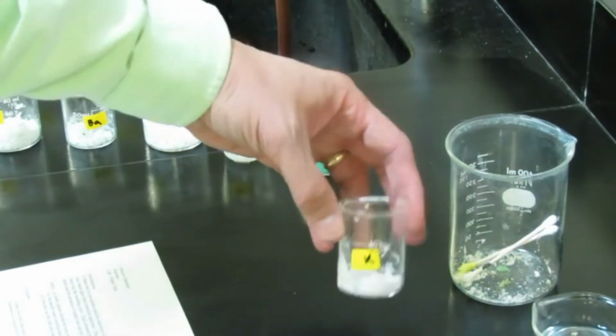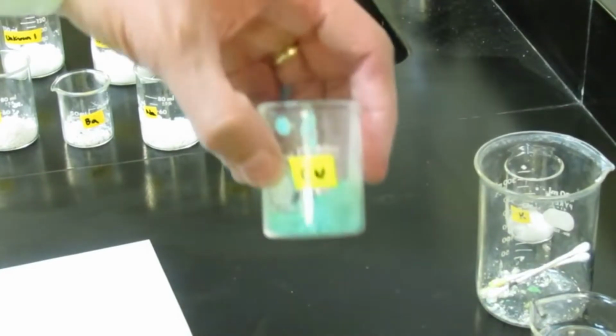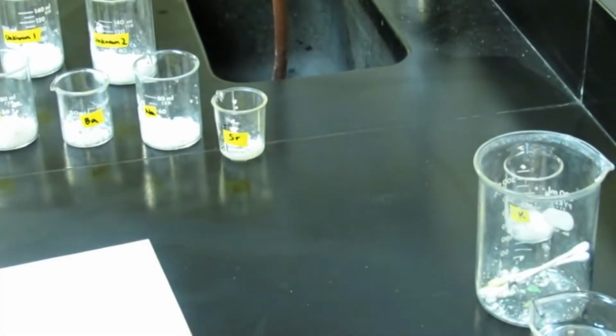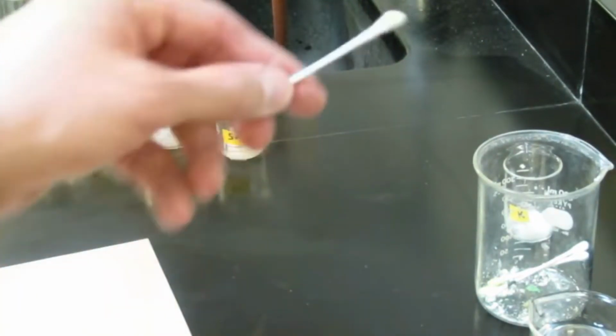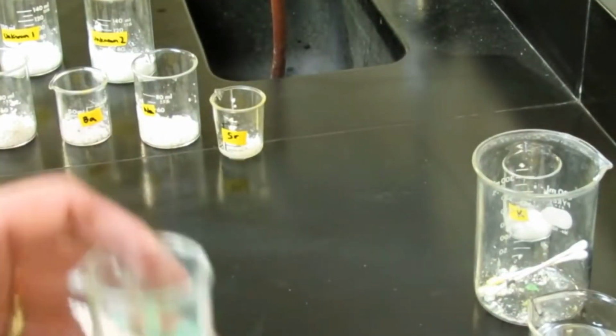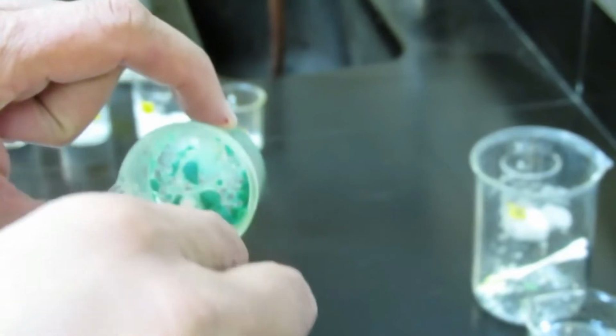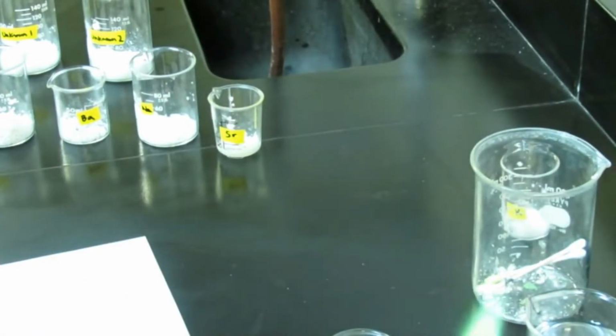Okay, so potassium is finished. We'll put that off to the side. And the next salt we'll do is copper. So we'll grab a clean cotton swab again, moisten the tip, and then we'll touch that to the copper salt. We'll get some of that copper salt on there. Oops. There we go. Not sure if you saw that, but we have enough of the copper salt on that swab. And we'll put that in the burner flame.